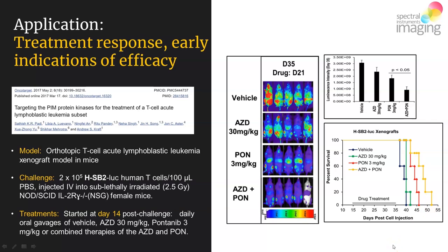The takeaway here from this study is that through the use of non-invasive in vivo optical imaging, the investigators were able to clearly discern differences in levels of efficacy by the different drug treatment paradigms tested.